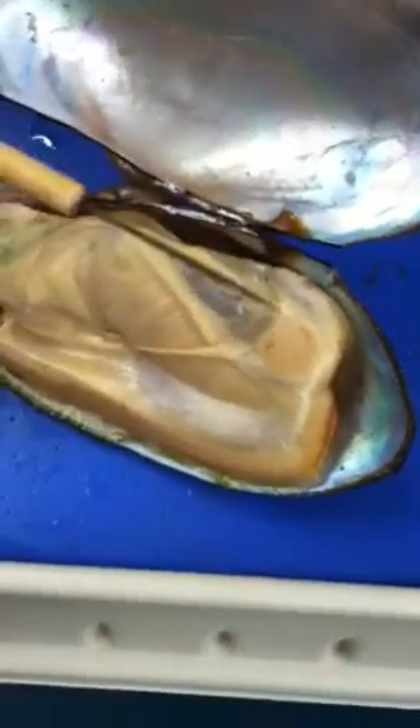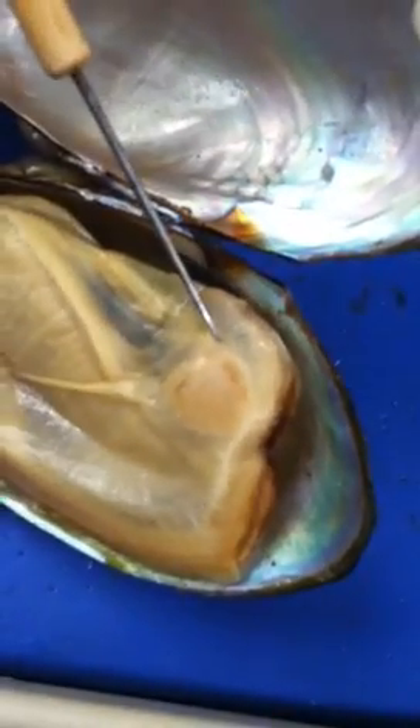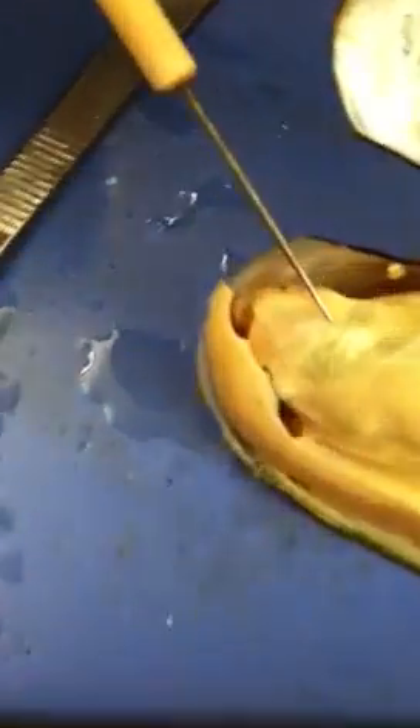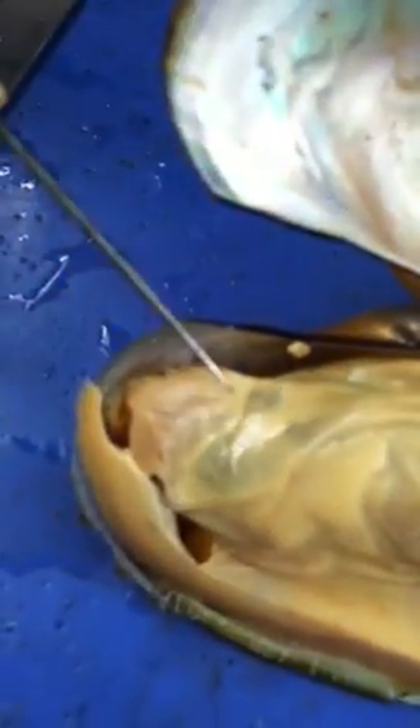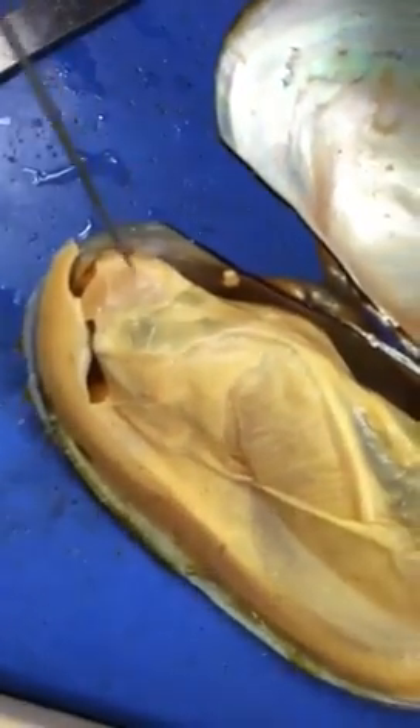Right by the posterior adductor muscle will be a smaller muscle called the posterior retractor muscle. There's also one pair right by the anterior adductor muscle — it's kind of tiny and hard to tell, but that's called the anterior retractor muscle.